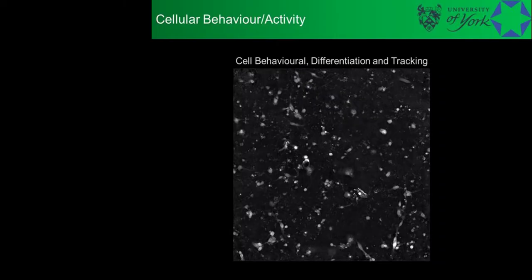We're now going to see that bright cell pop, lose its intensity, and the cell at the top is going to swoop down and eat that cell off that bit of debris. As soon as it's done that, it will notice a cell that was at 9 o'clock, and it's going to eat that in entirety to become a very large cell indeed. Ah, fat boy that's there. Now the yellow box is what we'll come to next.